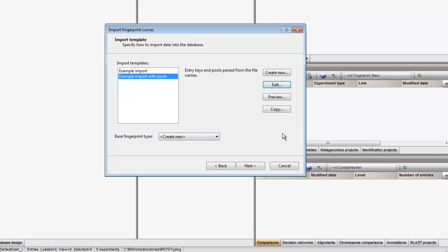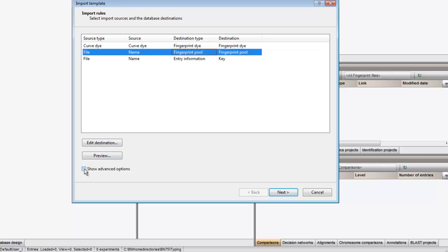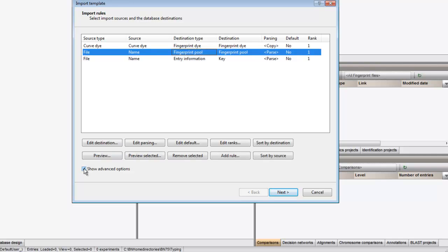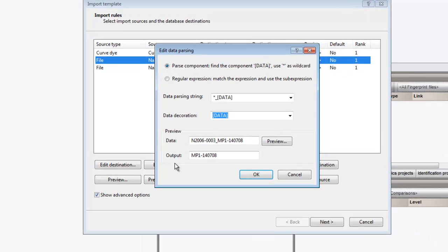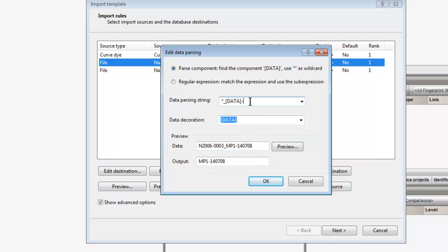I can adjust this by clicking Edit. Here I select the fingerprint pool, show the advanced options and go to Edit parsing. I add a hyphen and an asterisk to the parsing string.